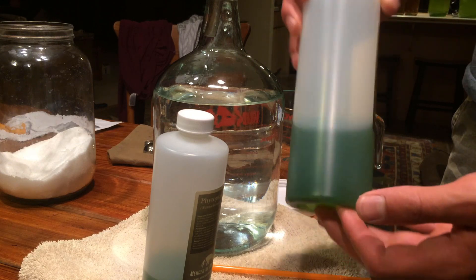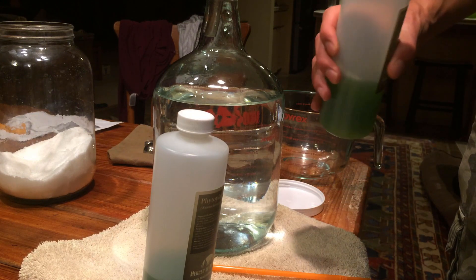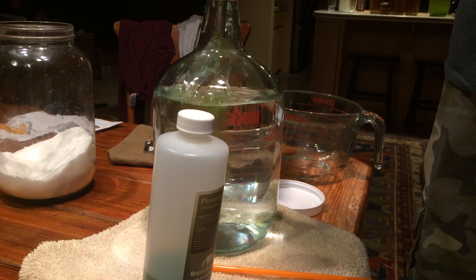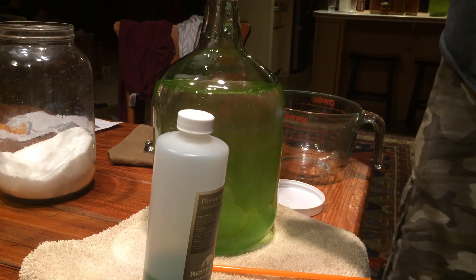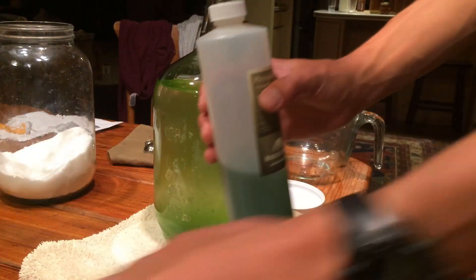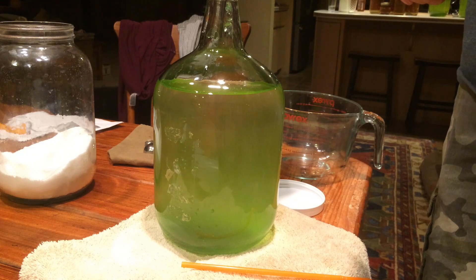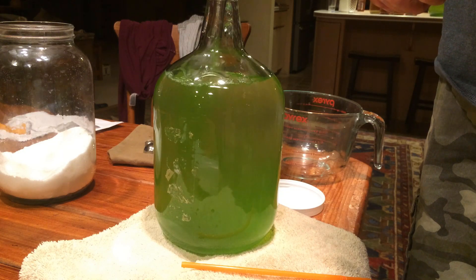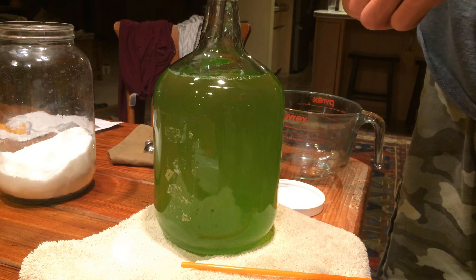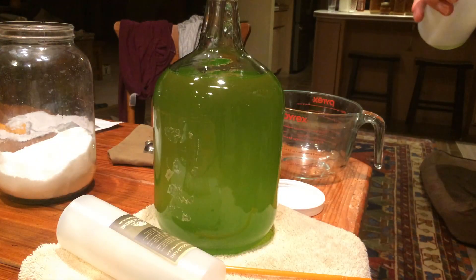First you want to make sure it is all well mixed in and none has settled at the bottom, then pour it in like that. Then you've got the second bottle - make sure to shake it up and pour it into the gallon jug. That is about perfect, that is about where you want it, just to allow for bubbling to happen. This one is slightly denser, actually about the same.